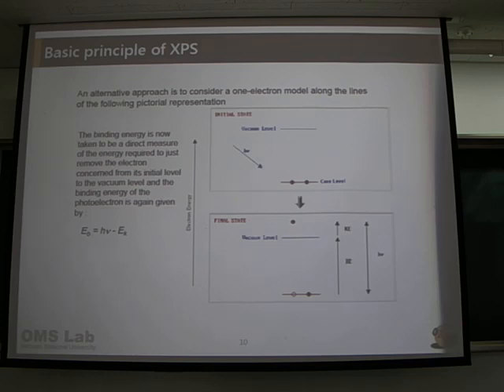Actually, from this experiment, we calculate the binding energy for any surface electron. When we apply the incident energy, there is photoelectron emission, and some energy is needed to eject the electron. This is called the binding energy. We calculate how much of the total incident energy is needed to eject the electron, and the excess, surplus energy gives that electron its kinetic energy, which the detector detects.